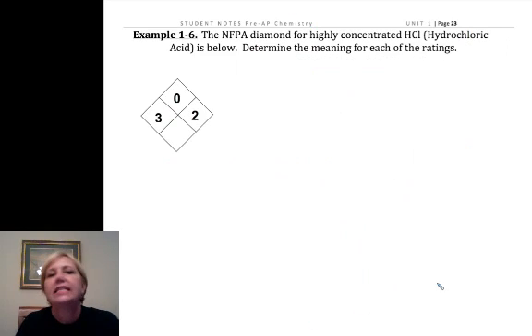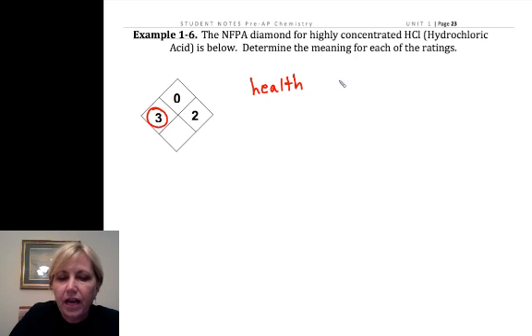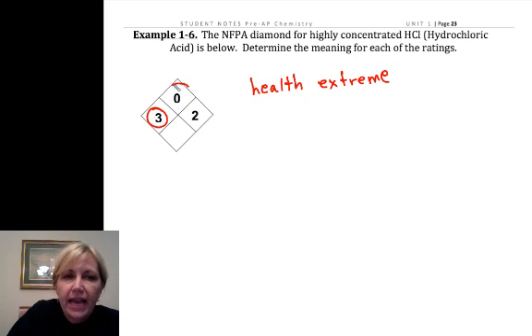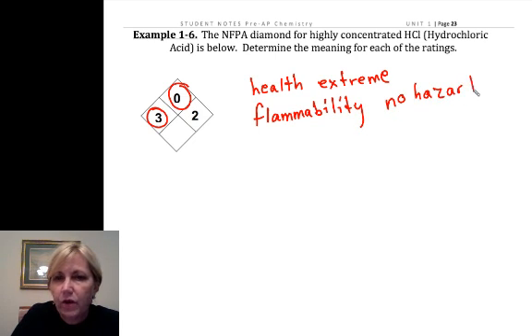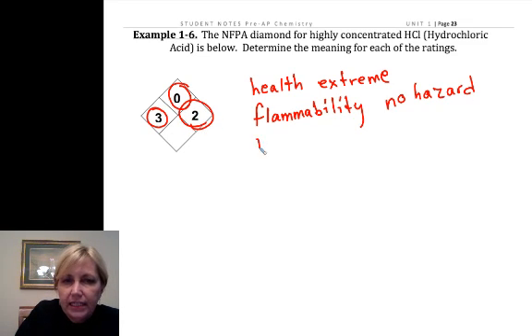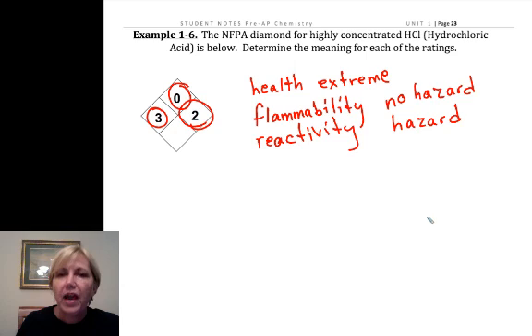If we look at this example, we have a three in the left-hand position. That left-hand position is health, and three means it's an extreme health hazard. We have a zero on the top — that's flammability — and there is no flammability hazard because it's a zero. The two is in the reactivity position. You'll have to memorize these positions and be able to read the diamond for your quizzes.